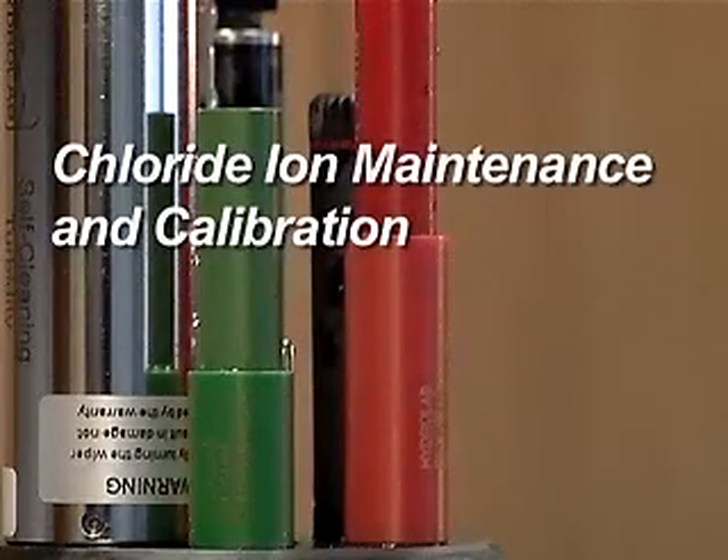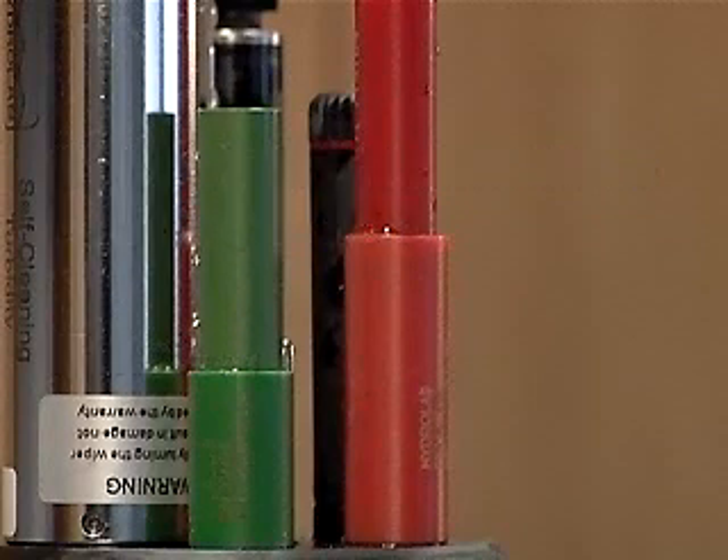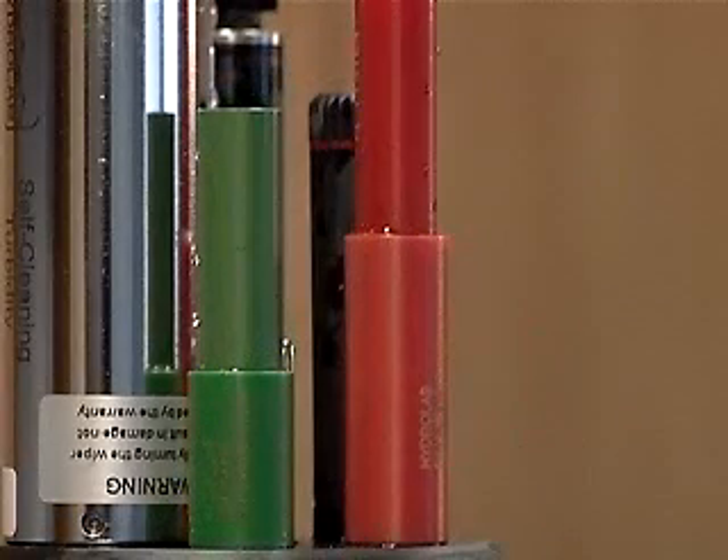The chloride ion sensor uses two electrodes to measure the electrical potential between a known ion concentration and the sample. The electrode on the sensor is a pellet of silver chloride in contact with the sample water. As the chloride ions dissolve from the pellet into the water, the excess silver ions build up an electrical potential that is measured with the reference electrode used by the pH sensor.